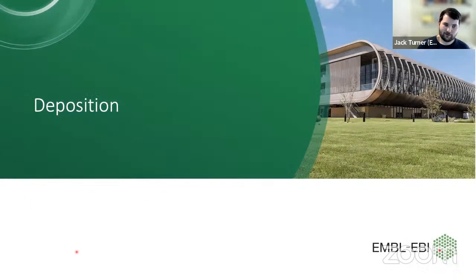Now let's get on to talking about deposition. So I'm going to cover two aspects here. I'm going to do EMDB deposition, and then I'm going to talk about EMPIAR deposition. It is worth noting that I work for the EMDB, I don't work for EMPIAR, but I've sat down with the guys at EMPIAR and put together some slides to show you today, which will hopefully be helpful when you come to deposit there as well.